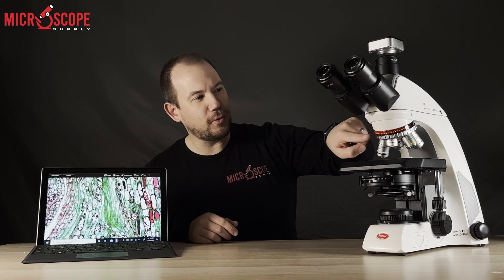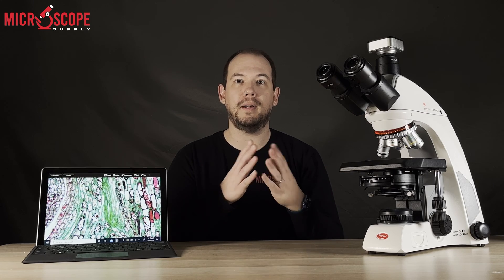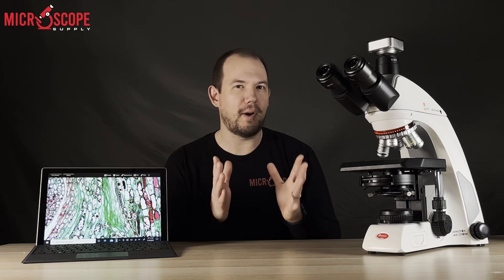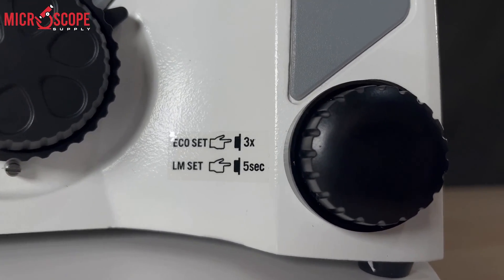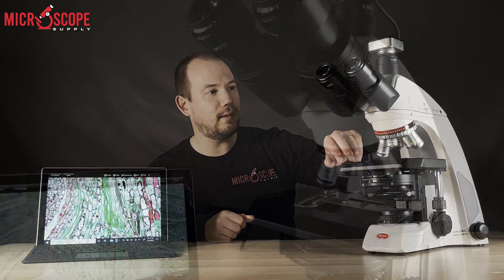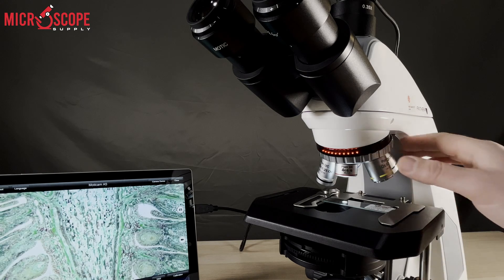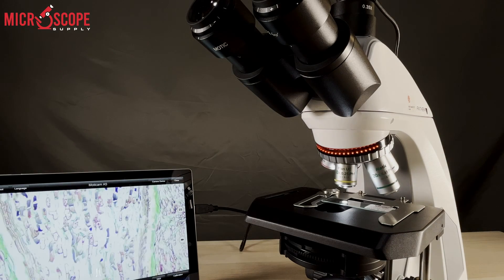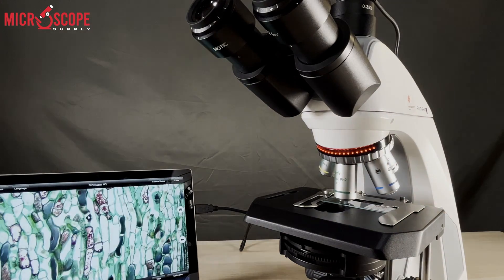Moving down, you'll notice there's an LED light bar, and this is what Motic calls their Light Tracer technology — one of the coolest features about the C2. The knob has an eco setting as well as an intensity setting. The way this works is I'll adjust the light intensity for each objective, and when I change to the next objective, you'll see it goes to a different light intensity — it's basically memorizing the previous light intensity for each objective.